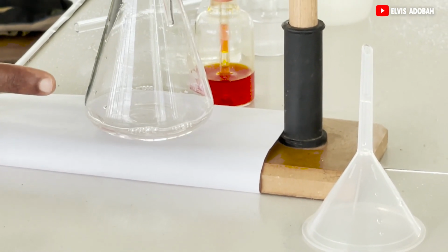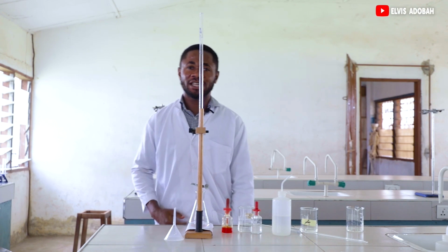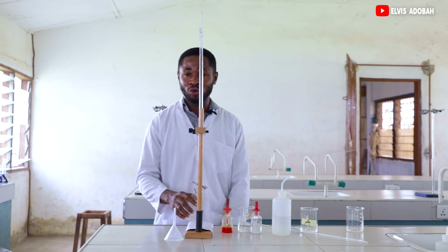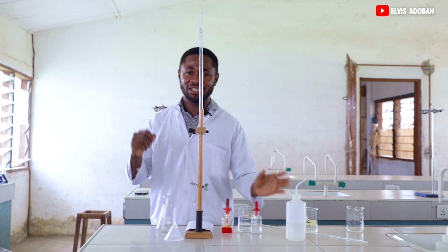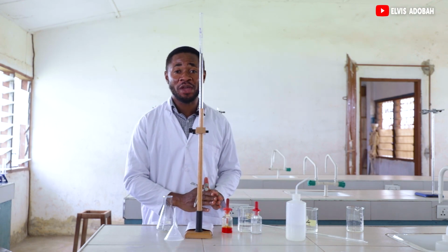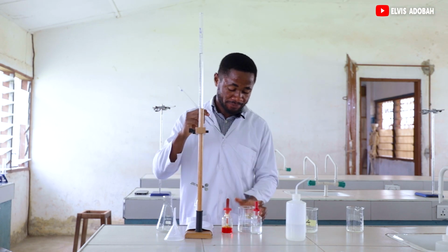Now, you can see a colorless solution. Then you come and read the volume. The volume is at 5.0 centimeters cube. That's it for the first titration. So what I'll do is I'll discard this solution. Then we are going to perform another titration again, but this time, we are going to use methyl orange as our indicator. Now don't forget to put down the value you had for the phenolphthalein indicator.